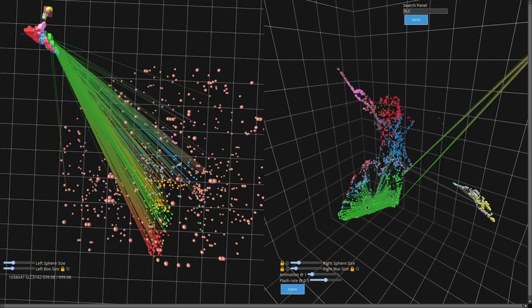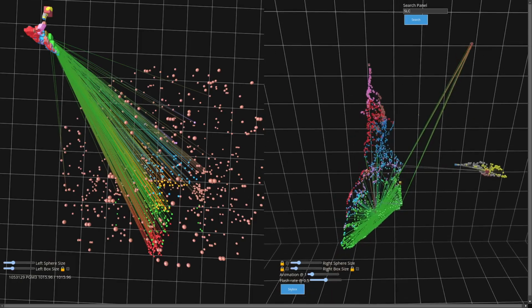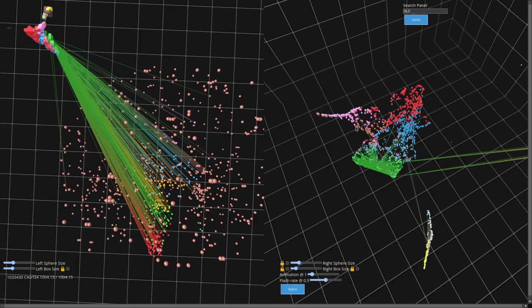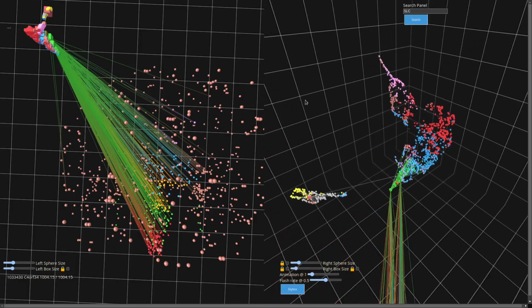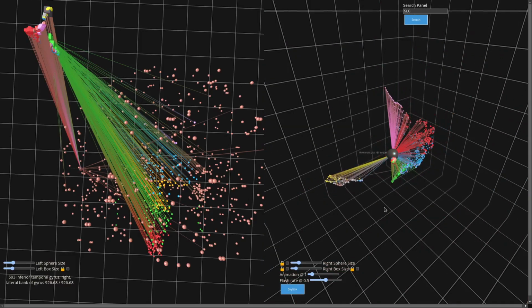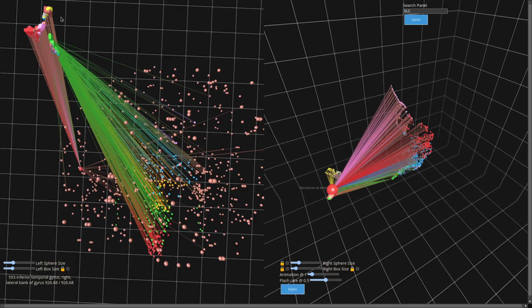So you can see the connections of the genes to other genes. Those are co-expression networks, and these connections, edges going to the brain representation over there, represent brain regions that express the genes that we selected, and you can see them in this view extending from the gene set UMAP embedding in the distance over to the brain regions in the foreground.